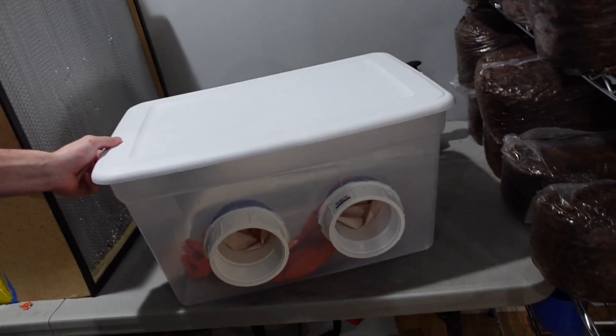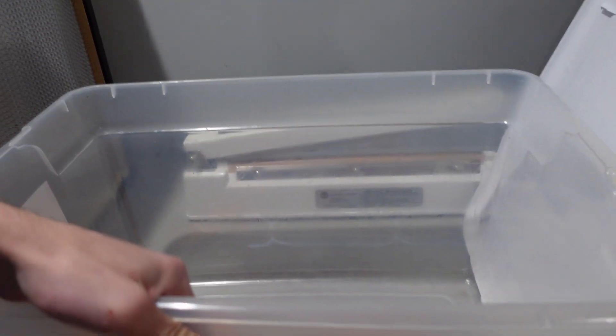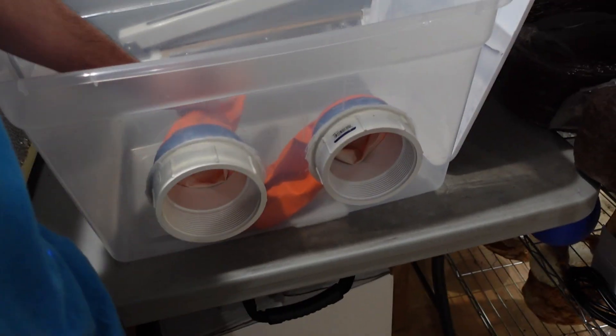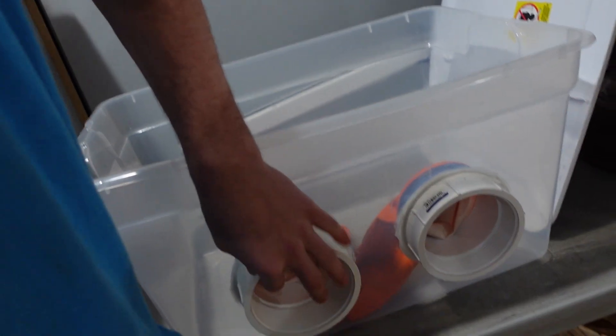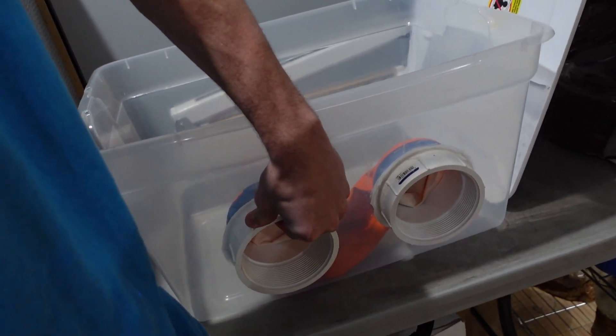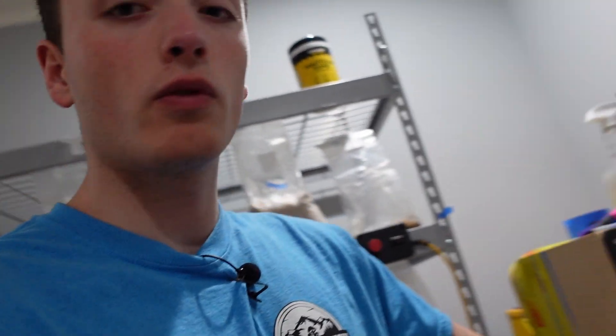Then we have another option, which is this big box here. It's called a still air box, and I built this one myself. You can maybe see there are some suds and stuff — that's because I use soap on the inside. Basically I use some caulk, cut holes, use caulk to seal it, and then I put these PVC fittings, and then I tape these gloves around the inside. And then I have my glove ports. The idea behind this box is to basically put whatever you're working on inside of it and no contamination will get inside of the box.